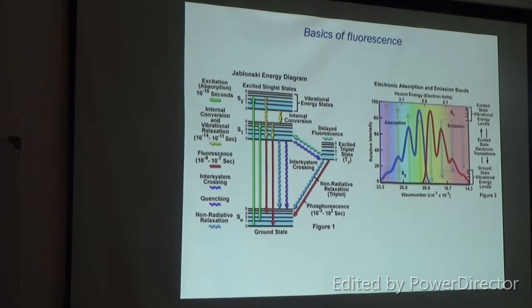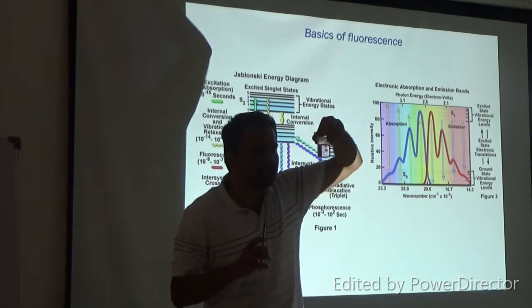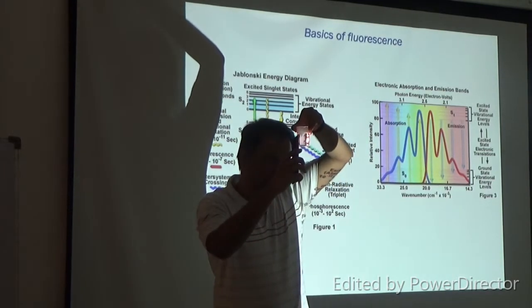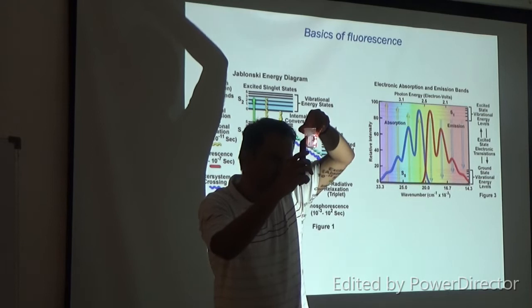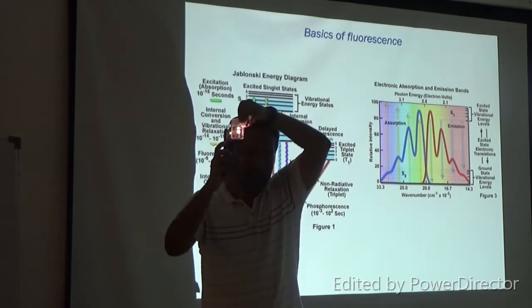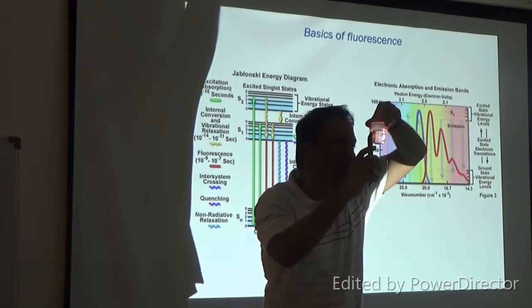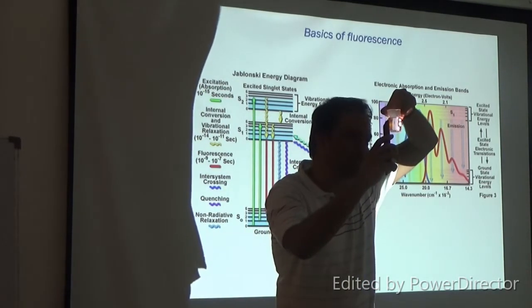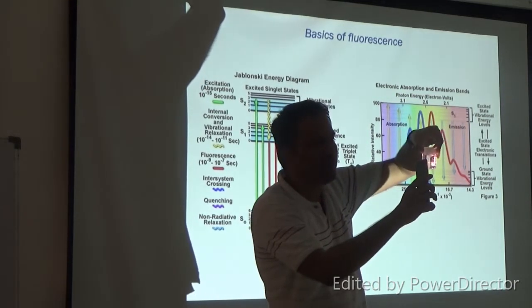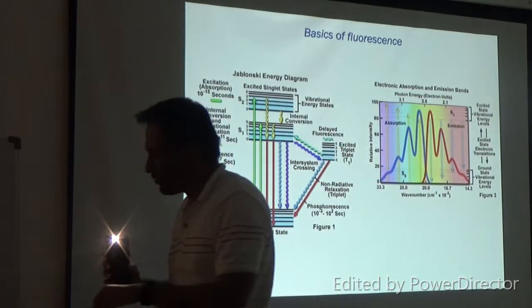On the other hand, I have another transparent fluorescent solution with a slight pinkish tinge, and this is something called rhodamine B. Now, do you see some orange color? From the back, orange color. In fact, this is excited in green and emits in orange. So this is rhodamine B. Do you see some orange color where the light is coming through the solution? Orangish. I think the green is easier.